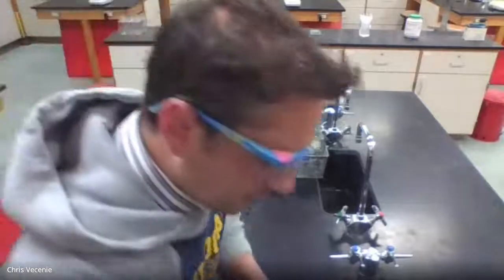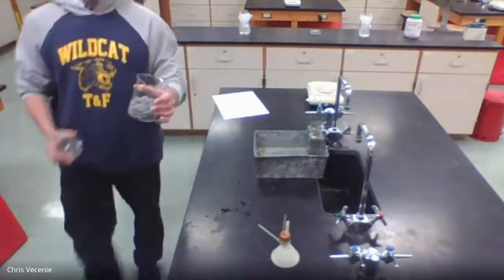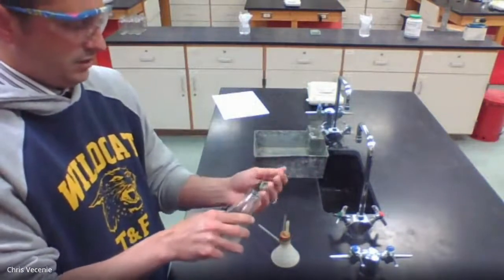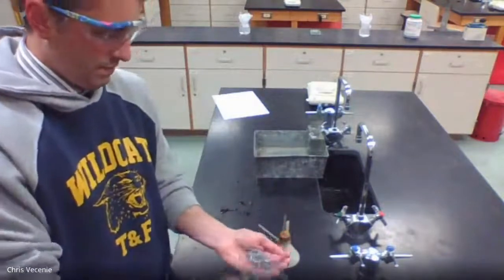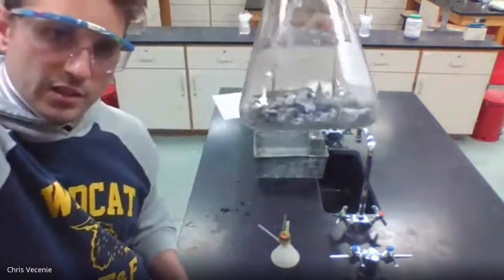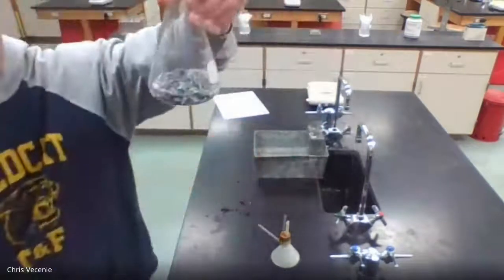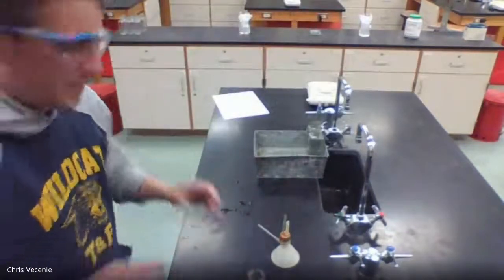Now we need to set up our generator. So just like last time, I'm going to take my Erlenmeyer flask. This time, on the bottom, I am going to put zinc rocks. All right, so these are our zinc-based material, and you can see that they're safe to touch, just the metal. I want to cover the whole bottom of this. Okay, so we get a good looking flask covered on the bottom. And like I said, I want it to be about half covered with the water, and that is to make sure that we can get good interaction between our acid and our zinc.